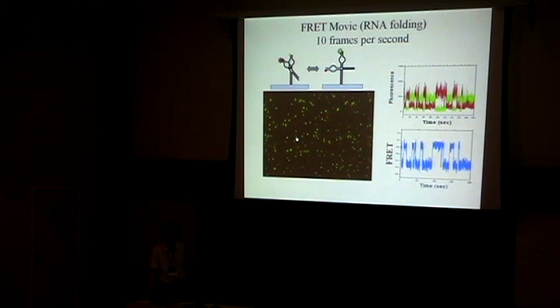Do you do any averaging in the movie? Is the reason that you get 10 frames per second a limitation? So this was obtained maybe 6 years ago when we had the older generation camera that no one in my group wants to use anymore. To get the best image, we had to use 100 millisecond time resolution. Now we can take really nice data with 15 millisecond time resolution using a new generation camera. In fact, the data that I show next was obtained using 15 millisecond time resolution. There's no averaging; the data time trace is shown with that time resolution.